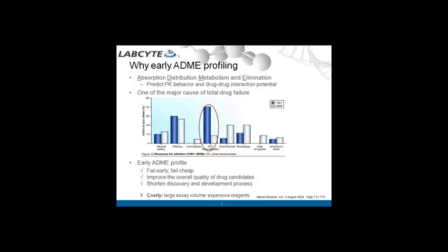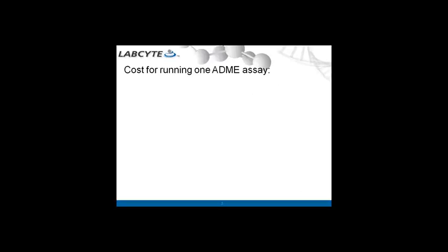The cost of profiling ADME early with a large number of compounds can really add up to the expense of drug discovery. This is why it has become one of the top priorities for many pharmaceutical companies to find a balance between discovery of the best drug possible and cost saving. Here, I just want to show you an example of how much an ADME assay costs in early drug discovery, for example, the cytochrome P450 inhibition assay.